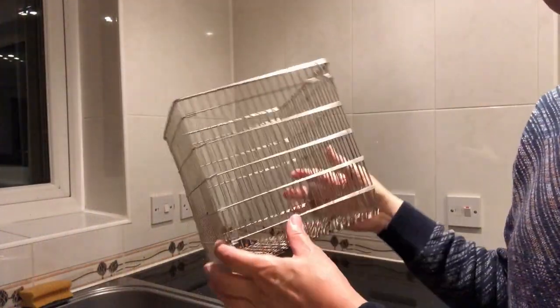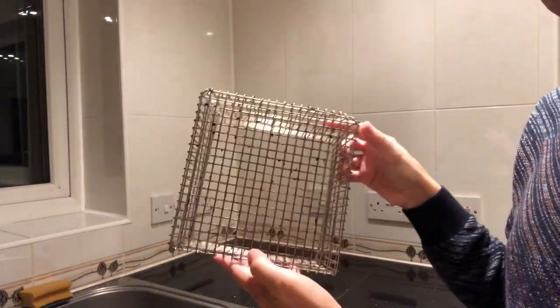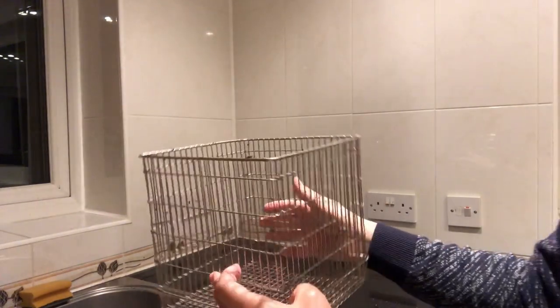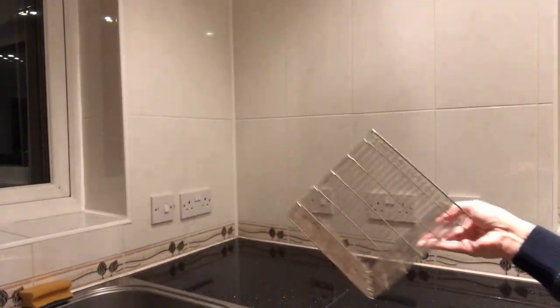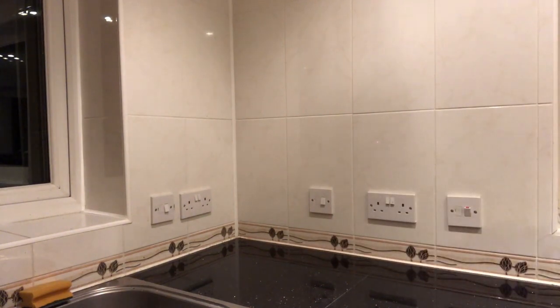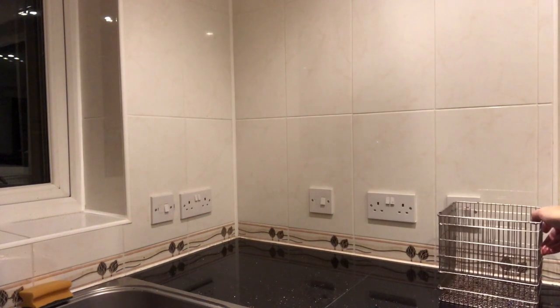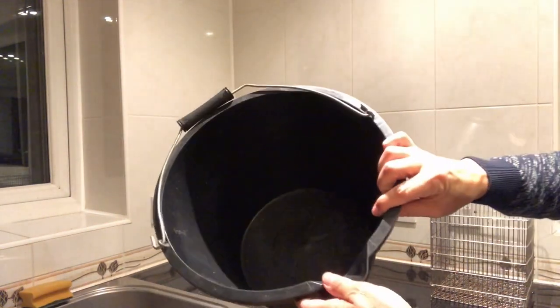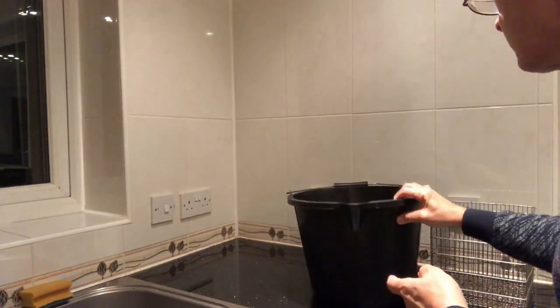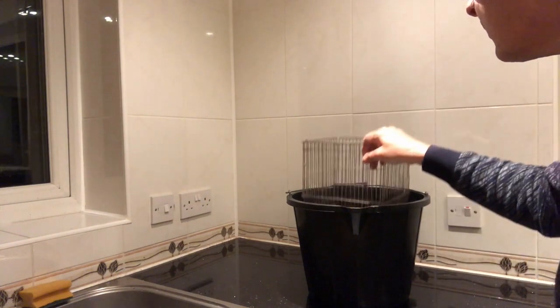This is the extractor I generally use. It's a stainless steel basket, about a centimetre mesh. I think this one originated from a works skip and was originally an autoclave basket. But there are many other simple things you can improvise, as I'll show you shortly. You also need a bucket — this one is convenient as the basket sits about halfway down in it without any support.